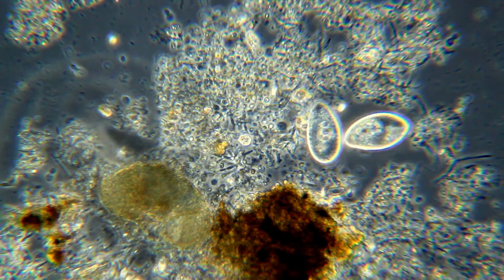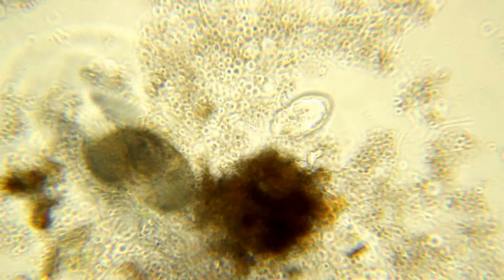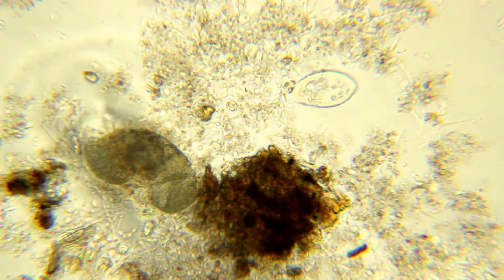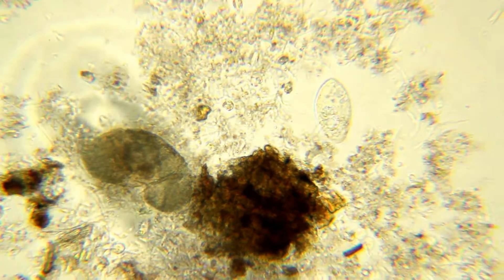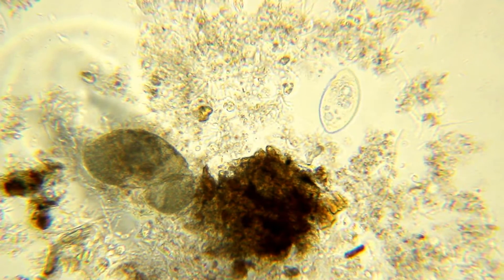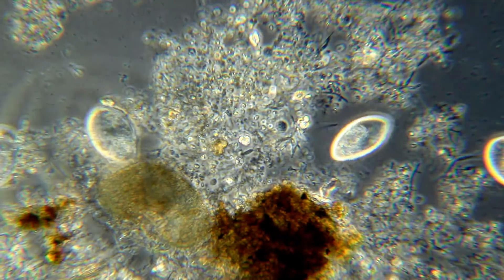Now I'll switch over to the regular Plan Apo 25 without Phase on it, and we'll see what difference that makes. It makes a whole lot of difference — you get a picture, but you don't get Phase. I can adjust all I want but we don't get Phase; we're getting basically a bright field view. I'll switch back over to the Phase objective again without changing anything but focus. Big difference.